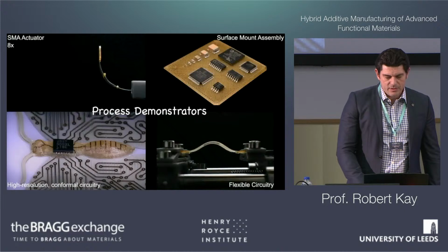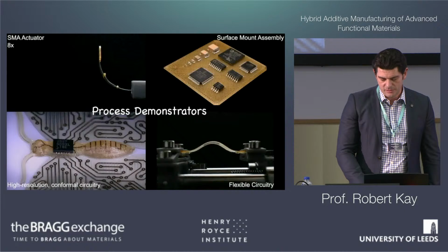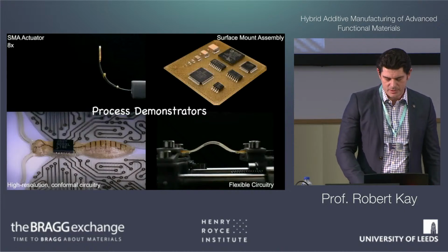Okay, so I'm just going to show a few examples of how we validated this as a technique and why we think this is quite an important way of analyzing and developing a 3D printing process instead of the sort of traditional methods of paste and inks.